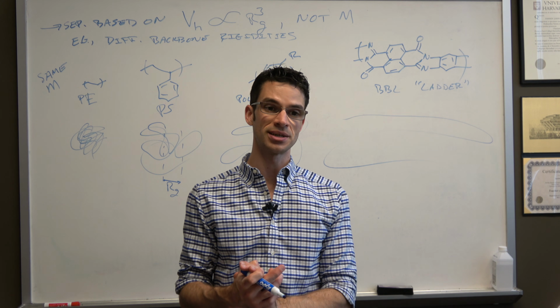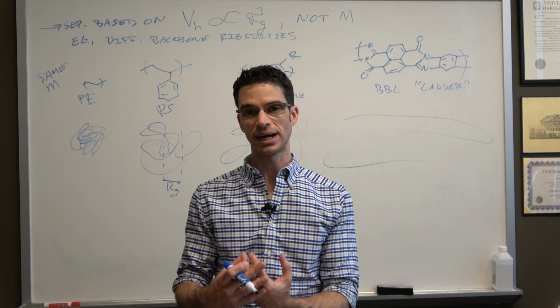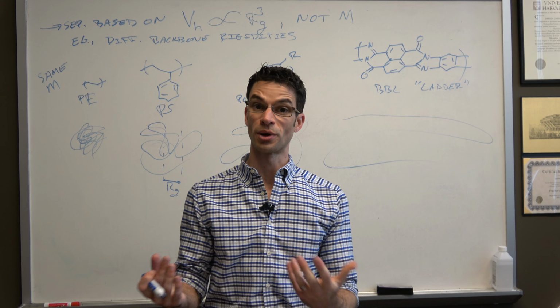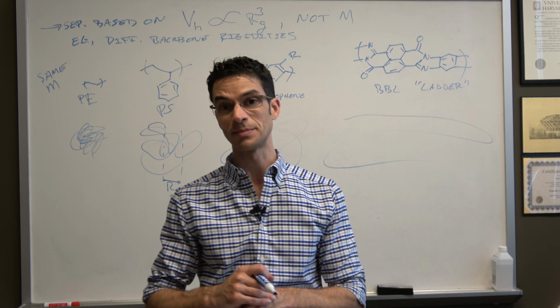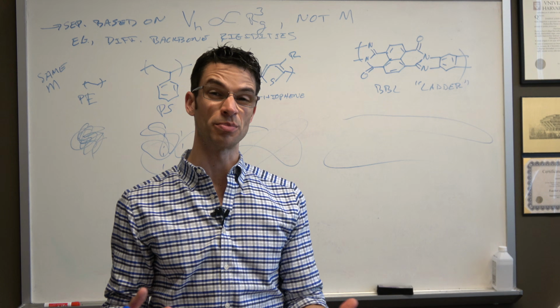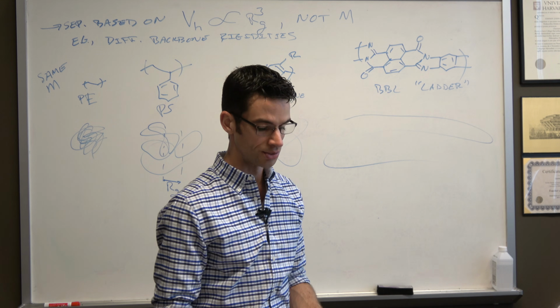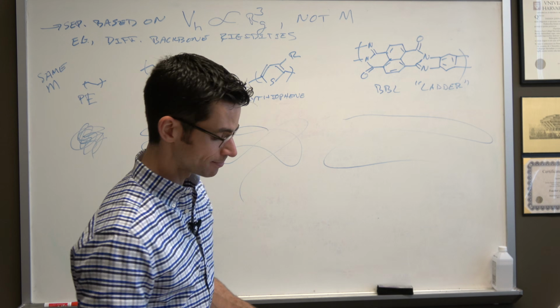So suppose you have some matrix that forms a specific interaction with the polymer of interest and might slow it down compared to the standard. Or suppose that your polymer is branched, and size exclusion chromatography is particularly bad at dealing with branched polymers. So highly branched polystyrene or polyethylene probably wouldn't respond well to determination by SEC.